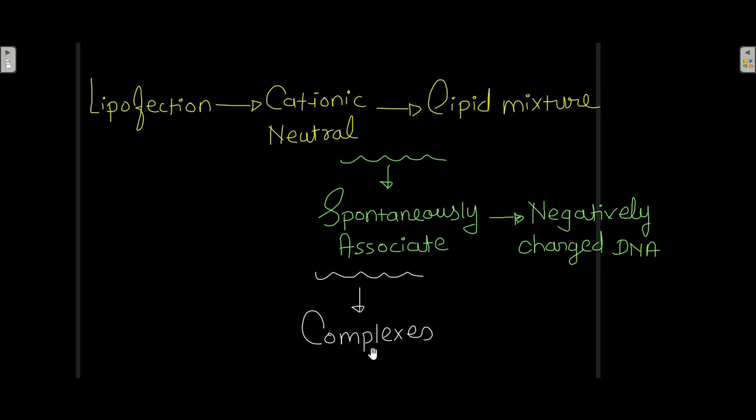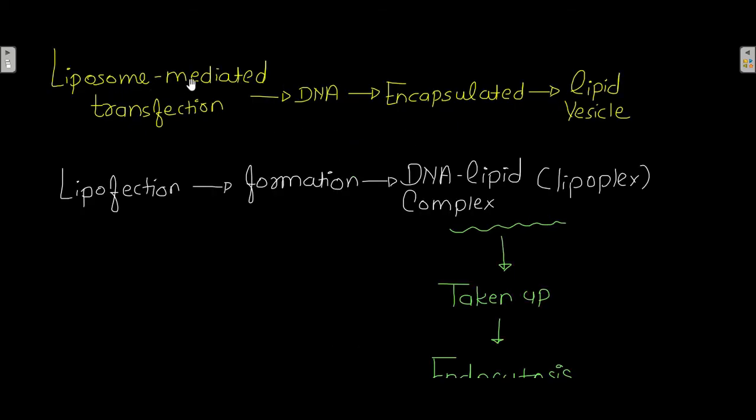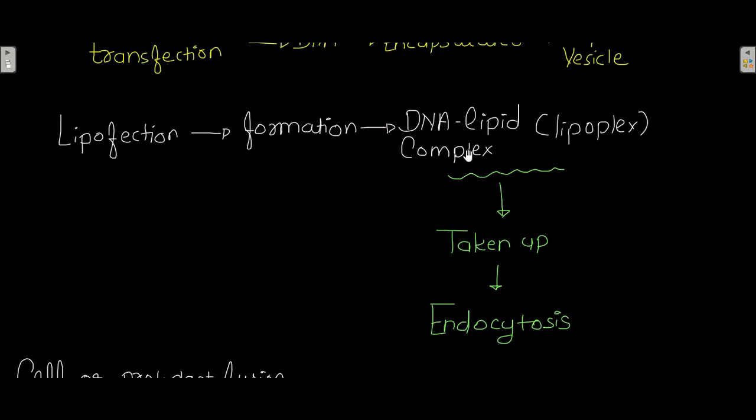Now, in liposome mediated transfection, the DNA is encapsulated in the lipid vesicle. But in lipofection, what is happening? There is formation of a DNA lipid complex, which is known as a lipoplex, and this DNA lipid complex is then taken up by the particular cell by endocytosis.